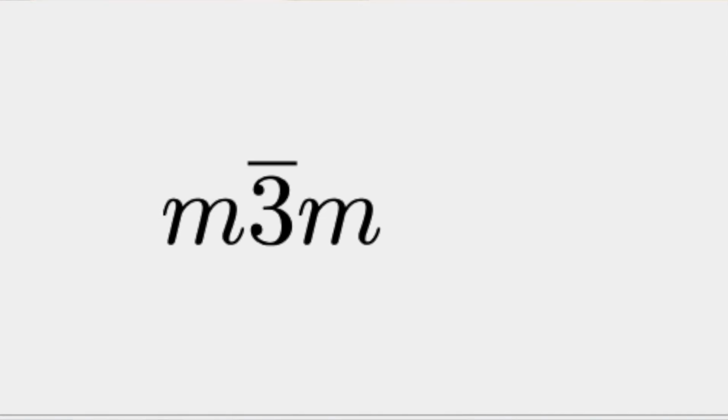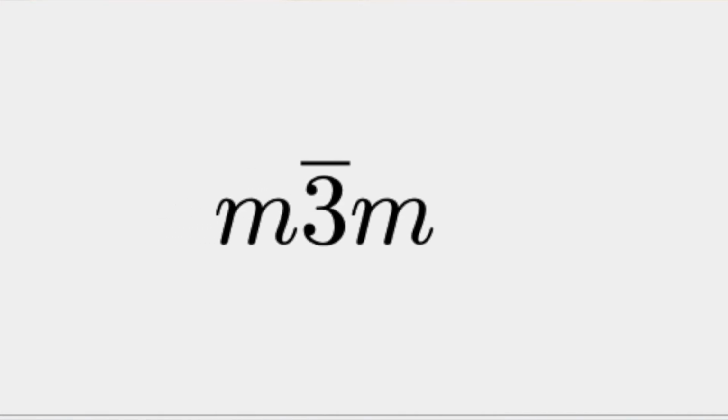So basically these crystals look absolutely beautiful, and they are reasonably symmetrical. We analysed 5 crystals, but I think 2 of them looked reasonably symmetric. That is to say, they had the external symmetry consistent with the symmetry of a cube, with which people are familiar, which people call m-3m.